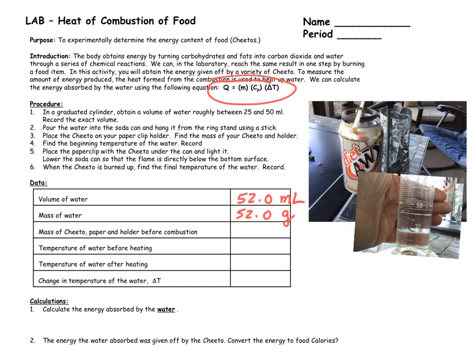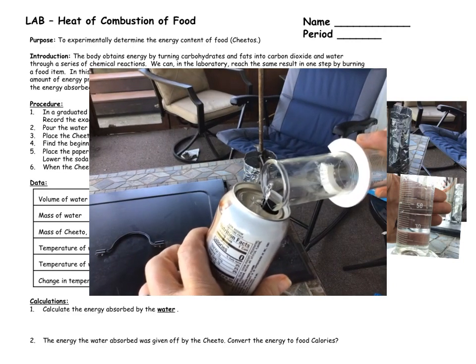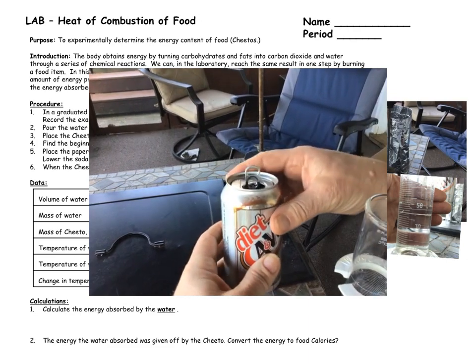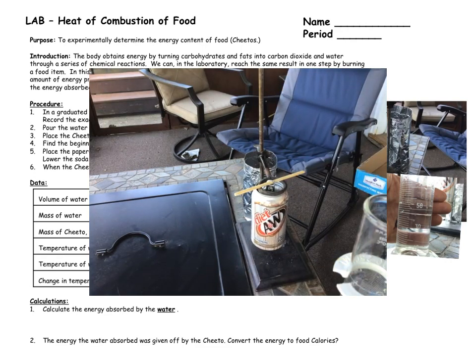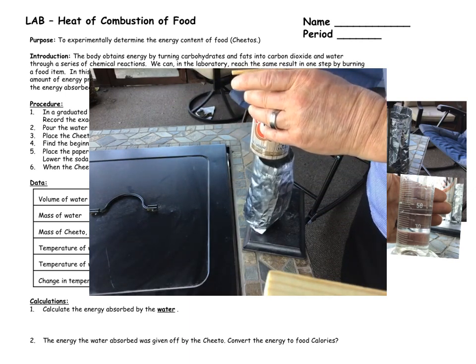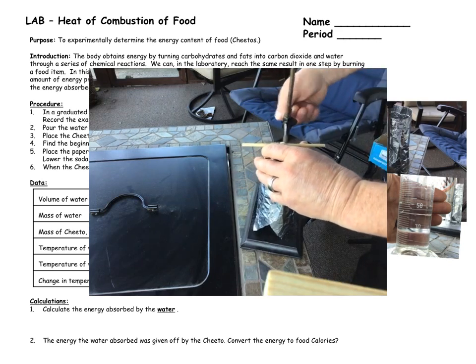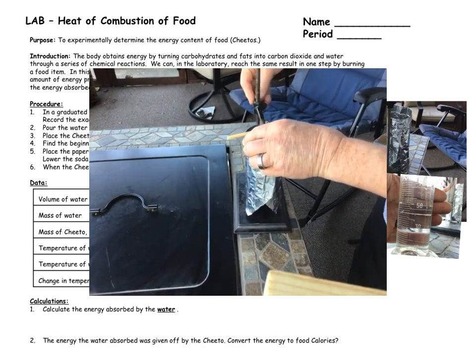Once we burn the Cheeto, it's going to warm up that water and the temperature will change. Let's pour it into our calorimeter, then put it on to the stand. We're going to burn the Cheeto underneath the can, lift it up, and set it right under there.